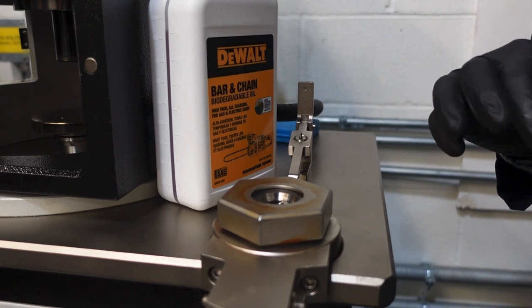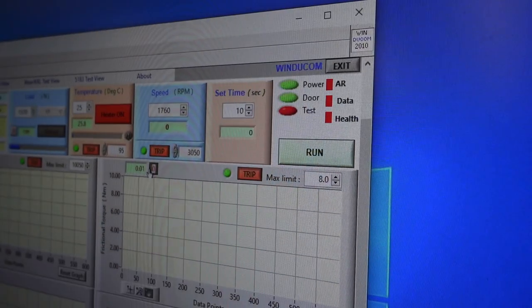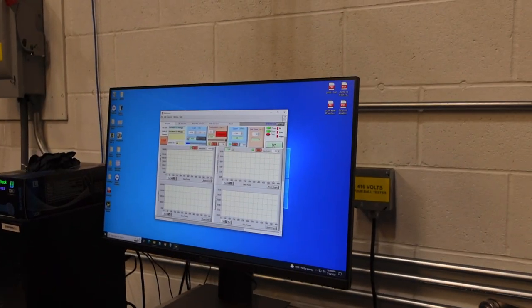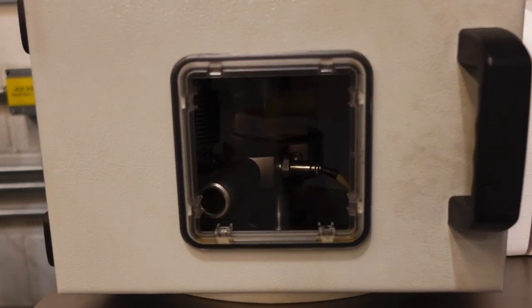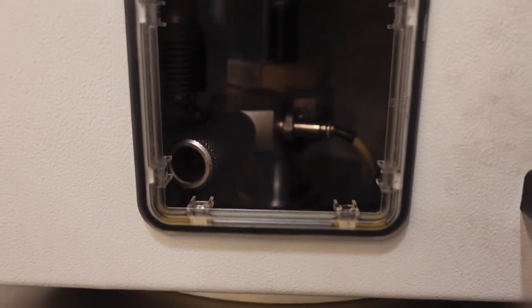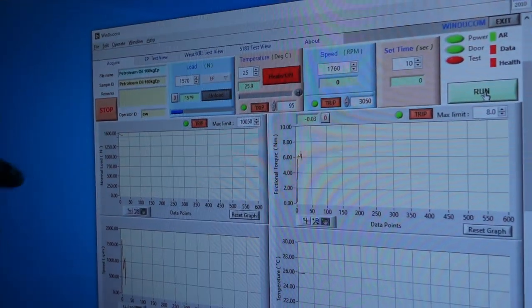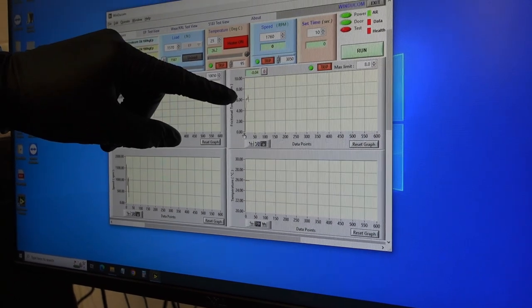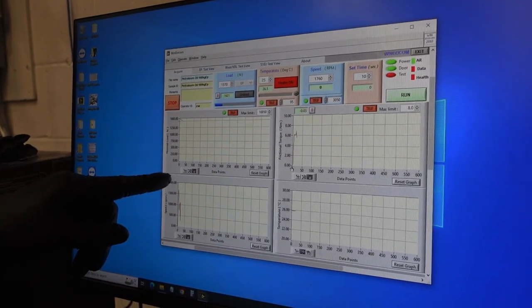The first test will be with the competitor because that'll give us something to think about. When I hit run, probably within five seconds, this is gonna start making a lot of noise. I'm gonna hit run — three, two, one. Okay, here's our readout. It's a very short test, but we can see the temperature, the friction that's gone up as we start transmitting load from the top ball. We can see our load is about what we've set it at. The speed shoots up for 10 seconds and then it slows down.